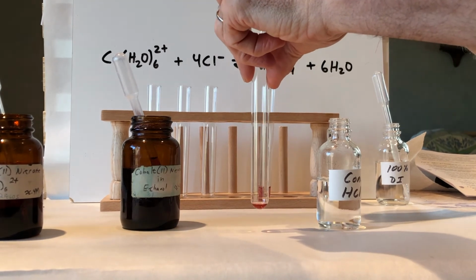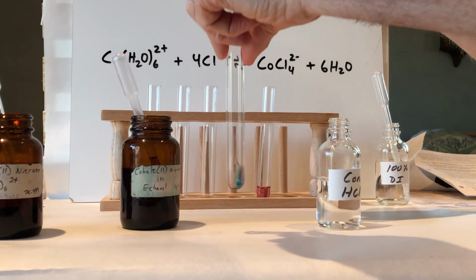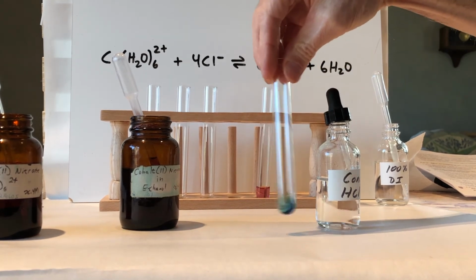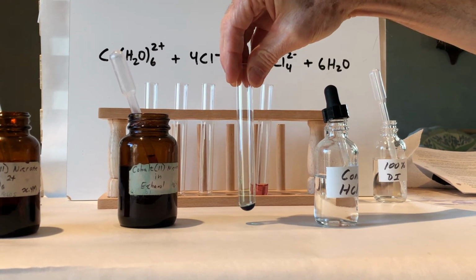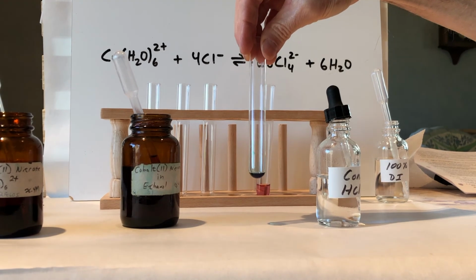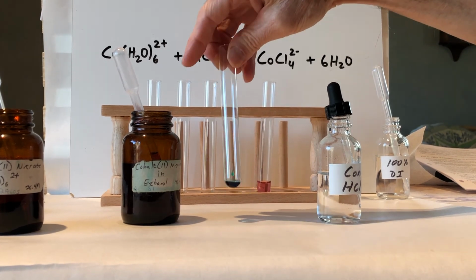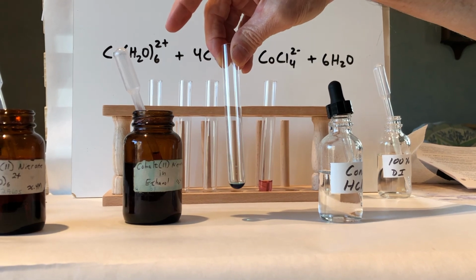And will there be a change in how much HCl is needed to make the change? So here's 1 drop. And hopefully you can see the color changed to blue, pretty much with 1 drop. Okay, so the last part of this part of the Le Chatelier's Principle Lab is to explain what's going on, why the difference in drops of HCl added to change the color of the cobalt ion when it was made in an ethanol solution rather than water.